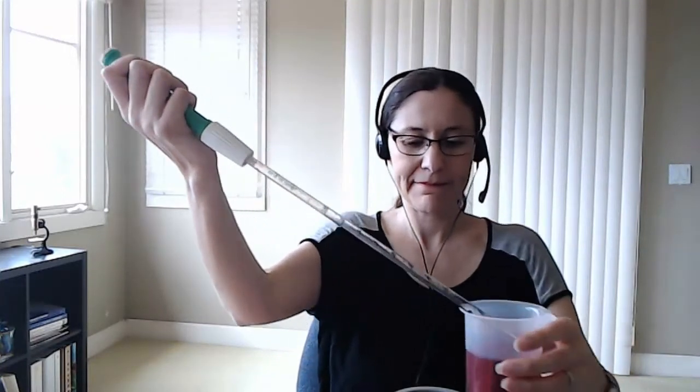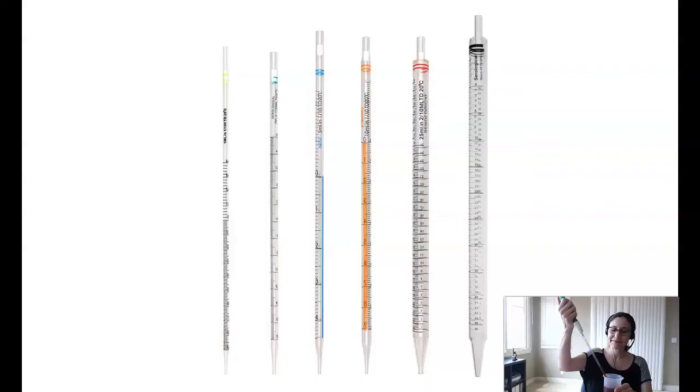Okay. That is how we use the pipette. So the other method that we can release the volume, the easiest being pushing this button here that I showed you. The other method would be just rolling this wheel back down. And as you roll it, you see you are releasing the solution.